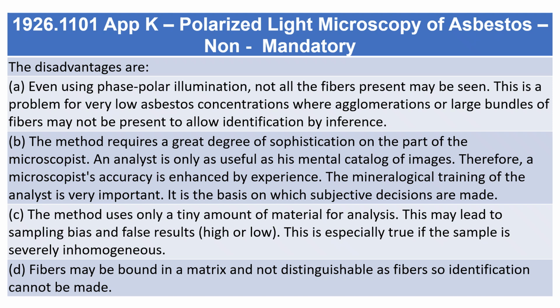B. The method requires a great degree of sophistication on the part of the microscopist. An analyst is only as useful as his mental catalog of images. Therefore, a microscopist's accuracy is enhanced by experience. The mineralogical training of the analyst is very important. It is the basis on which subjective decisions are made.